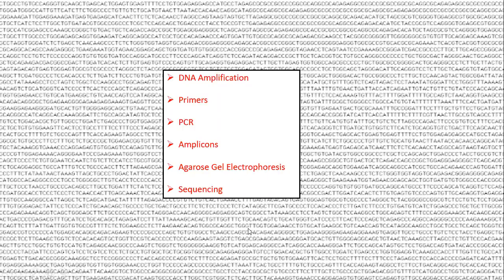It's a lot of junk, a lot of repetitive elements are there. For example, TTT I'm seeing here, 3 T's here, 5 T's here, 3 T's again. So you may have a repetitive element of a given nucleotide there. That is really important for RAPD to identify polymorphism. So we will quickly brush up on fundamentals again. We will talk about each step slowly.